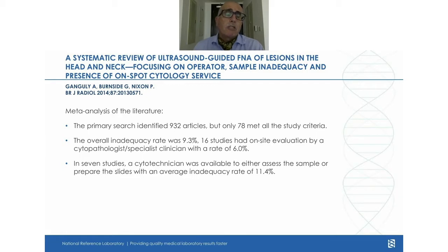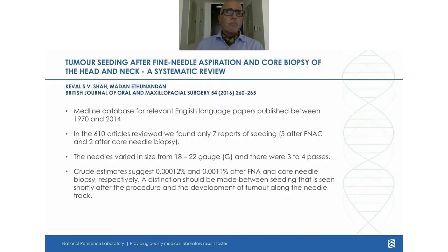When it's not possible, of course, the best thing is to liaise with the cytopathologist and the lab in order to agree which is the best way to process the material and to send it over.